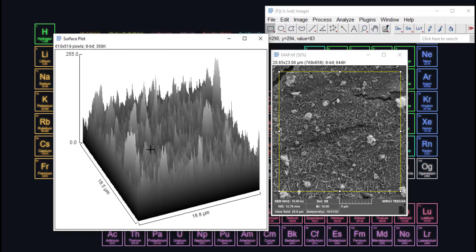You can compare which area has more roughness and which area has less roughness.